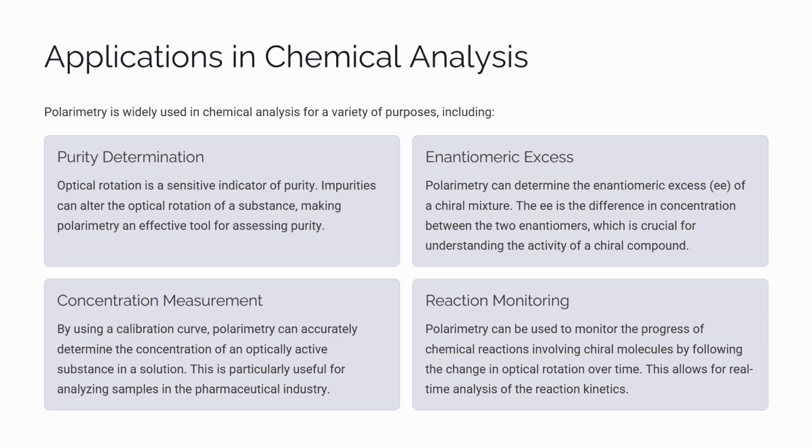The second is enantiomeric analysis. The polarimeter helps in calculating the proportion of each enantiomer in a mixture, which is crucial in the pharmaceutical industry. The third one is reaction monitoring. By tracking the changes in the optical rotation, we can analyze the progress of a reaction in real time.